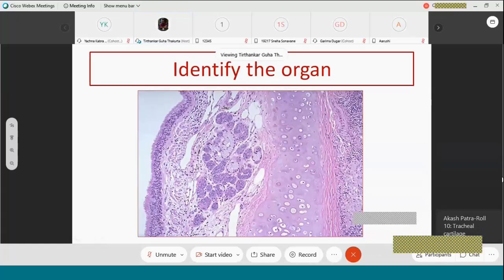Very good. So we have ciliated columnar epithelium arranged in a pseudostratified manner, below which you can see these blue things. You already know that they represent glands, and the white things are the mucous glands. So there is a mucosa. You can see above there are serrations. It looks irregular. That means there is a ciliated mucosa. Then you get a large number of glands.